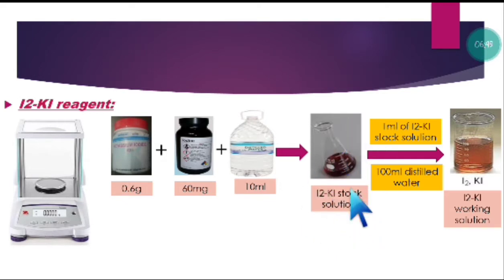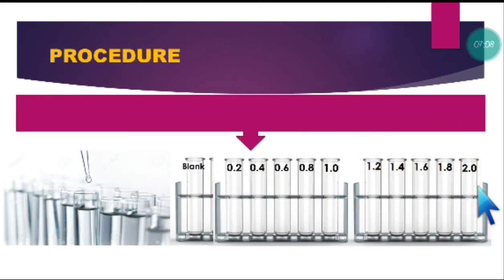We need to dilute this stock solution for using in the experiment. So for the working solution, we will take only 1 ml of this stock iodine solution with 100 ml of distilled water. So this will be the working solution. Now coming to the different procedures.